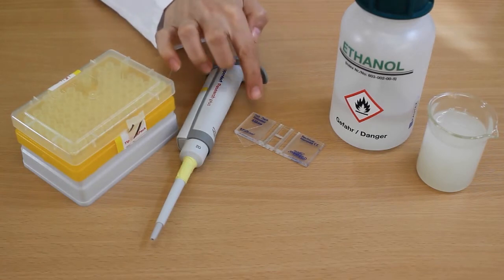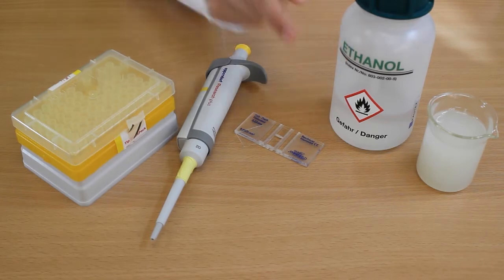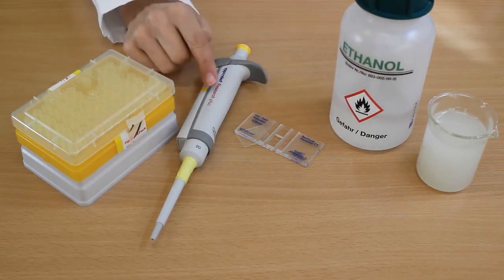For the exercise you will need a hemocytometer, its coverslip, ethanol, your sample and a pipette with tips.